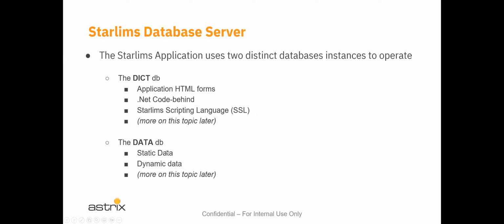The database instance hosts the static data, the definition, for example, of tests, workflows, sample types, instruments, users, along those lines. But it also hosts the dynamic data, and that would be workflow-related data. Anytime a sample is accessioned, and forgive me, because the first time I heard the word accessioned, I wasn't a laboratory person. I was just basically a Python application developer and had never even heard a workflow term. So the word accession, and you'll hear that a lot interchangeably with folks saying sample receiving or creating a new sample in the system. It's also called accessioning.